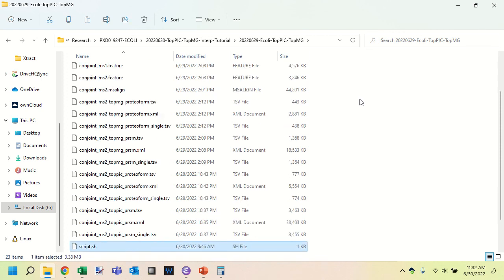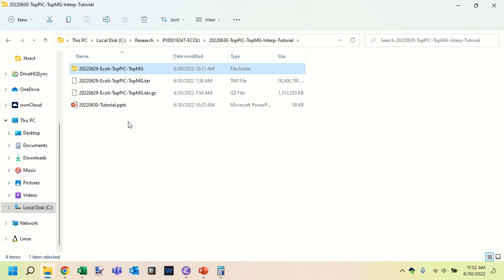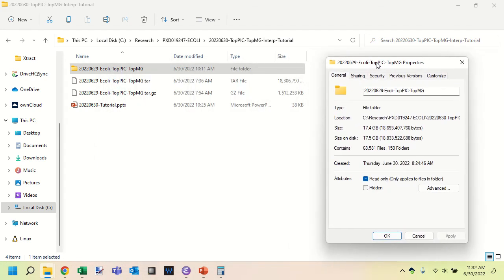Now, I would stress that it's probably a very good idea for you to leave these files zipped up rather than keeping them extracted in that way. And I'll try to explain why here. I already did a quick look at just how large these directories of files are. In this case, we see that we have 17.4 gigabytes of HTML and text showing up within that directory. That's quite a lot. Compare that to this tar.gz file that represents all of those files stuck together and compressed once.